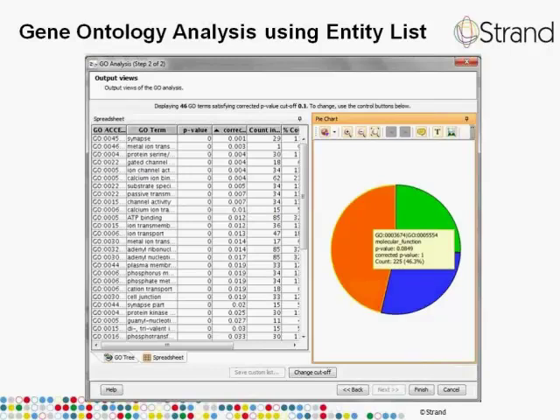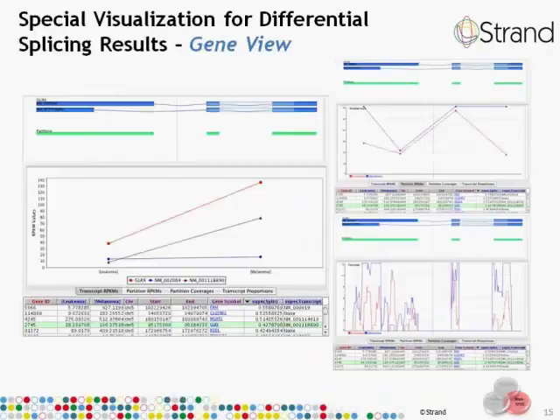So once a list of interesting target genes is constructed, the annotation of those genes can be evaluated using GO or gene ontology function and the pathway analysis function in the same tool. However, we all know that it's not a gene that's expressed, but its constituent transcripts. Alternate splicing events are found in a high proportion of cancer cells, either as a consequence of cellular abnormalities in cancer cells, or more importantly, as the cause of cancer growth.